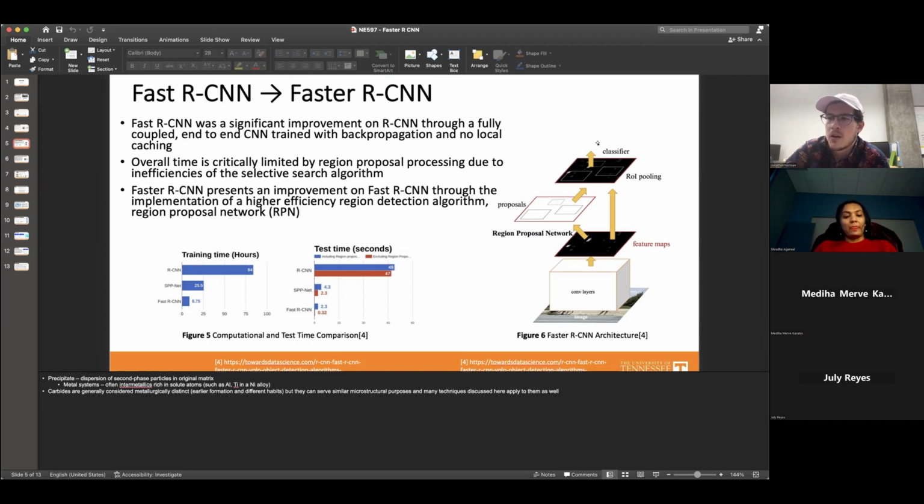So we have an absurd data set that we're continuing to grow. And I think a very cool opportunity to apply computer vision would be to apply it to DIC, because one of the limits in DIC is that at super big strain rates, your actual speckles start to rip. And when your speckles tear, your conventional software can't do it anymore. Okay. And when we're doing the DIC for this, we're doing clad bursting. So we're heating and pressurizing cladding tubes until they literally blow up. So the strain rates are massive. Okay. So I'm interested if computer vision can be applied there to possibly improve it.